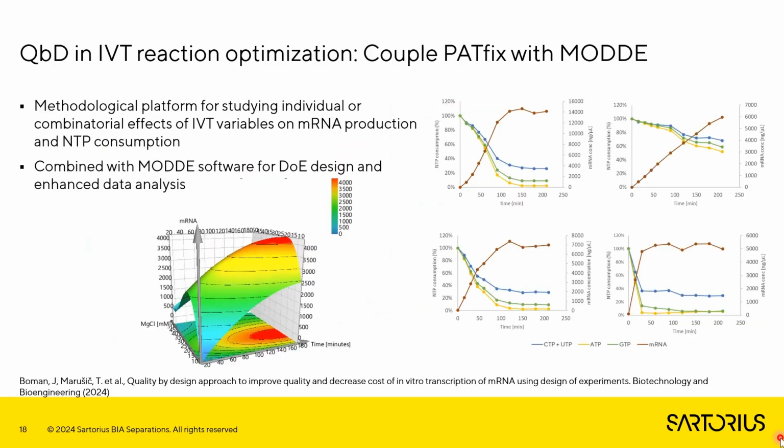What I really want to tell you about today is the story of how we can now apply this immensely powerful analytical tool, which is able to separate mRNA from nucleotides, from DNA, from capping reagent, to build a knowledge base of the IVT reaction by coupling analytical technology with a design of experiment software approach.